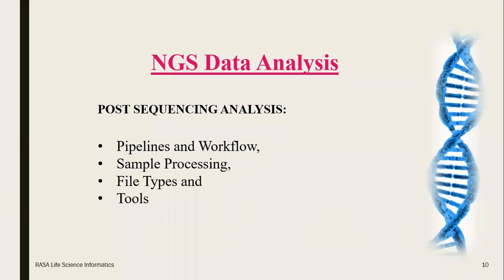Now, we have come so far and have understood the NGS concept, its history, the technologies, various platforms and applications. Before going to understand and take up your training on NGS analysis, let us learn a few concepts for the same. Some important points like workflows, pipelines, file types, tools employed, we need to understand, and this is very important. So let's begin.